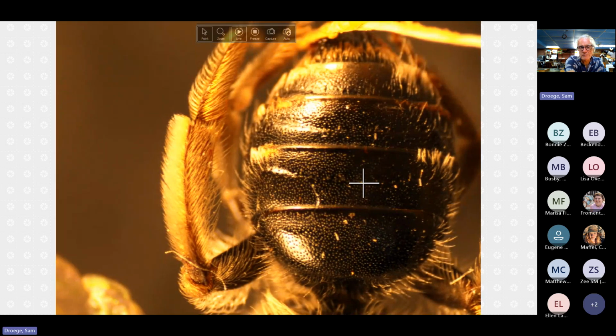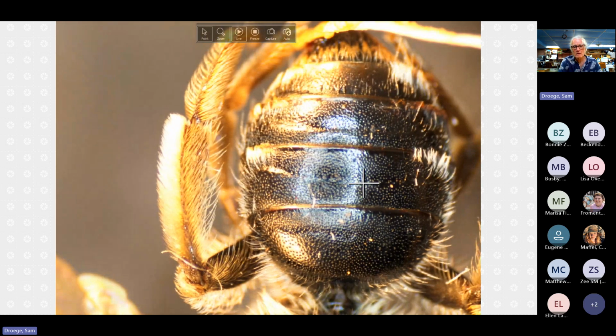it doesn't really help, does it? I think it's visible. So here, and we'll see other specimens that look like this. So we'll see this depressed area here. If we actually looked at the elevations, this is a little bit higher, this is a little bit lower. You can see these lines. Here it is on T3. We don't use T3 characters, but it usually mirrors T2.